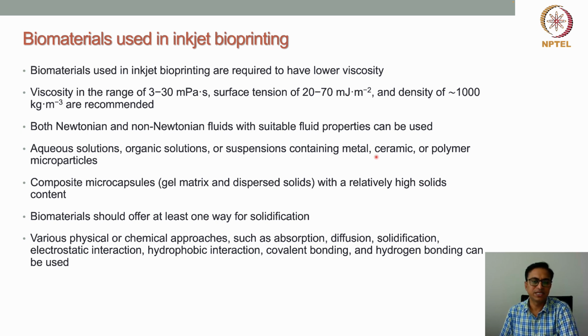But when we talk about inkjet 3D printing, the nature of the process is such that during printing, while they are inside the nozzle, they should be in the solution or liquid state.